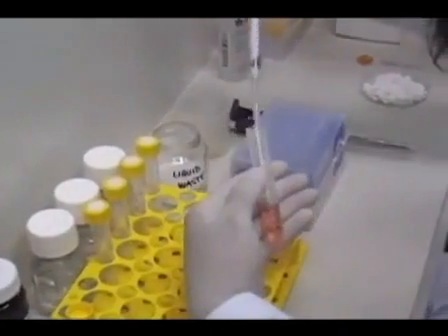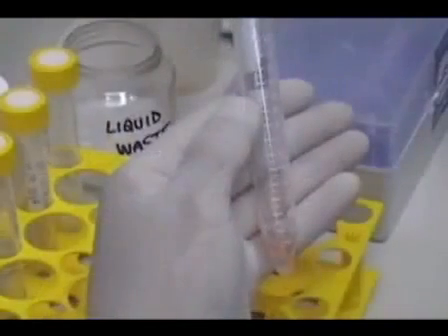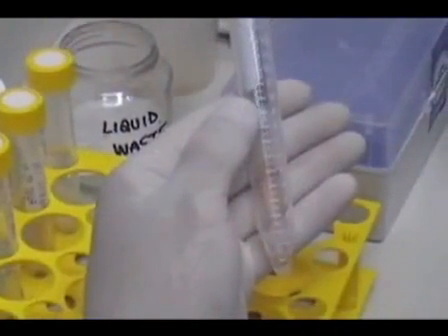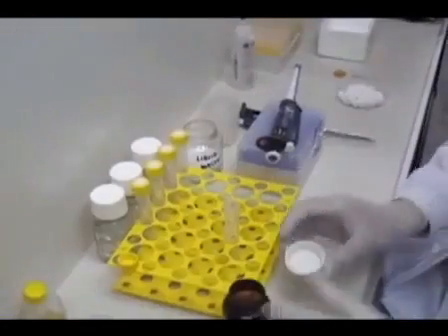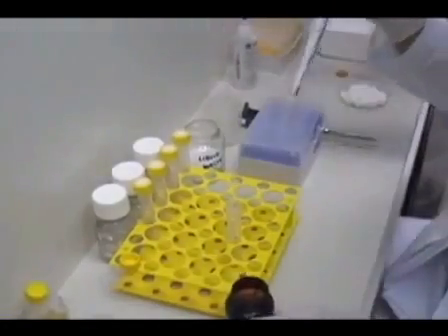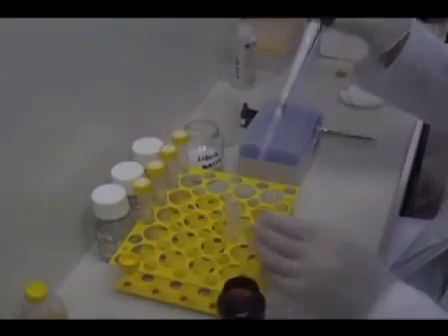After EBs are decanted, the culture media is carefully discarded. You should be able to see the pellet at the bottom of the tube. Now we can proceed to the fixation procedure. EBs will be fixed in 4% paraformaldehyde solution in PBS, or phosphate buffered saline. It is important to resuspend the pellet with PFA solution.